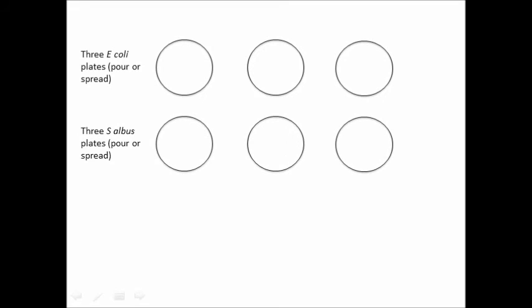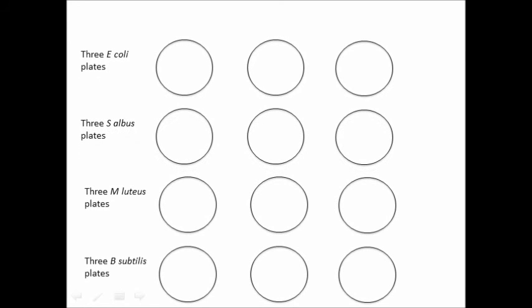Begin by preparing three pour plates or three spread plates of Escherichia coli using aseptic procedures, and label your three dishes. Then prepare three plates of Staphylococcus albus and label them. Finally, three of Micrococcus luteus and three of Bacillus subtilis, and label them too.